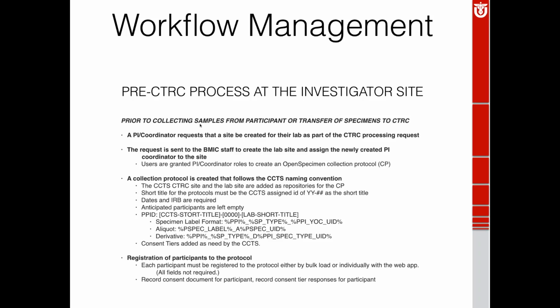I think it originally came out of Medical University of South Carolina for a research project management system. I believe they're not using that now, they're using Spark, but that ontology is useful to us as well. And I believe that was posted on a wiki page for a future feature request on the OpenSpecimen wiki.